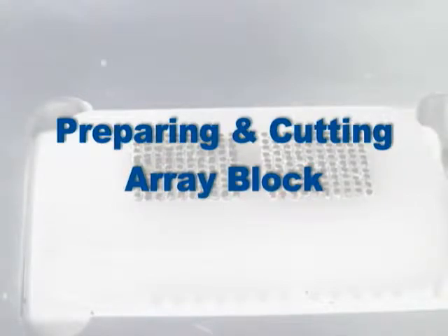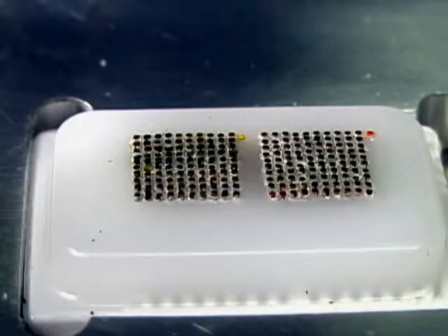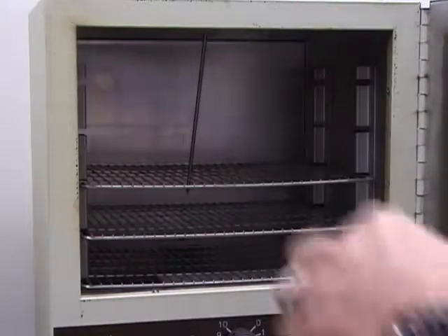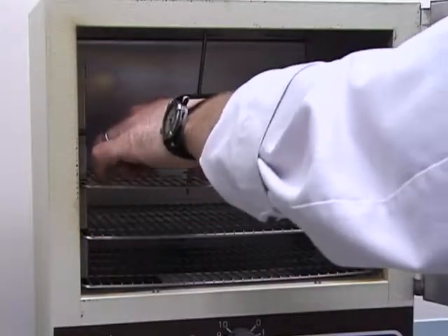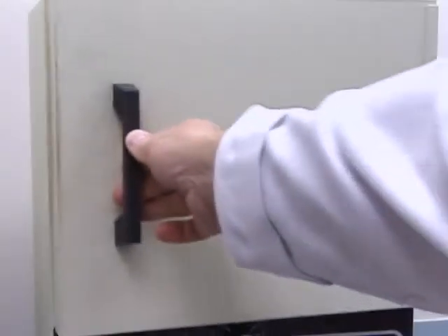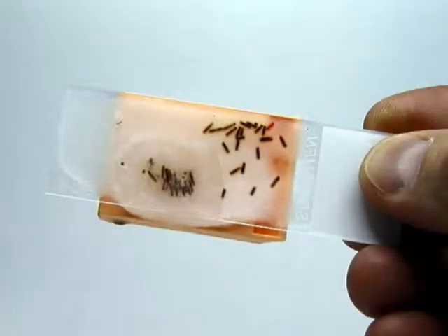If you try to cut an array at this point, the punches will either slip deeper into the block or fall out completely. The paraffin needs to be melted slightly to stick the punches to the paraffin. Place the array block on a glass slide, punch side down, in an oven warmed to 37 degrees Celsius for around 15 minutes. If it is too hot, you could end up with this.